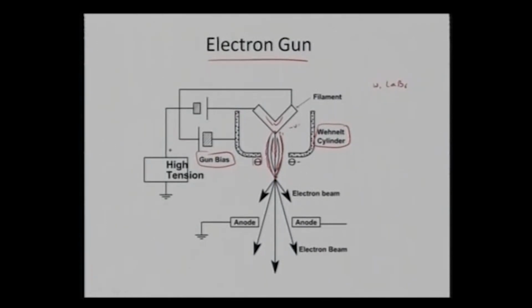Electrons are negatively charged particles, and they get focused, or repelled, by the negative bias, and from here they are accelerated, because I apply a certain positive potential. So now I help the electrons to accelerate to finally get an electron beam. In this particular case I can utilize a tungsten or LaB6 filament or even a field emission gun as my electron source.